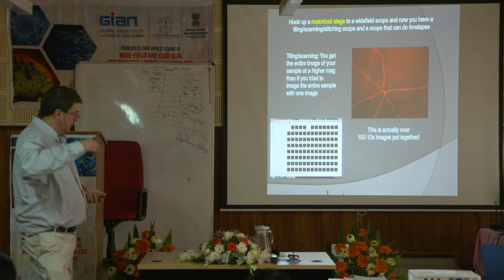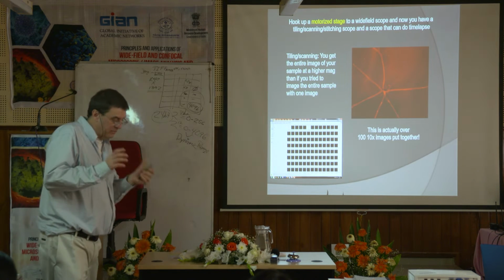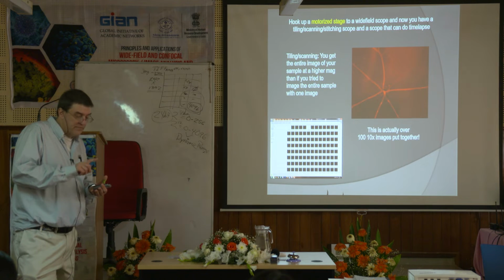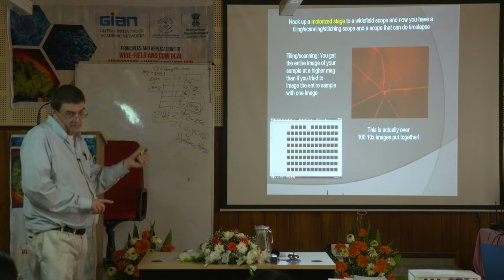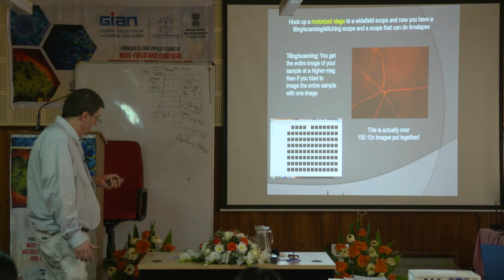So I think if you're buying a system, put your money in your objectives, put your money in your camera, and if you have money left over, start thinking about a motorized stage next. I think it's the next most useful thing you can put on a system.